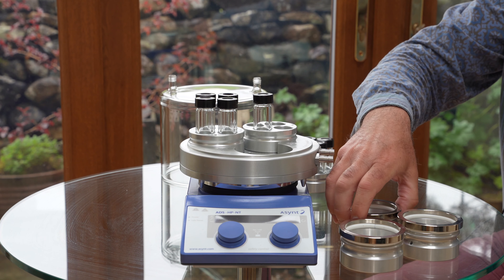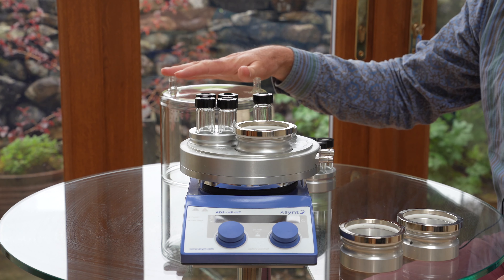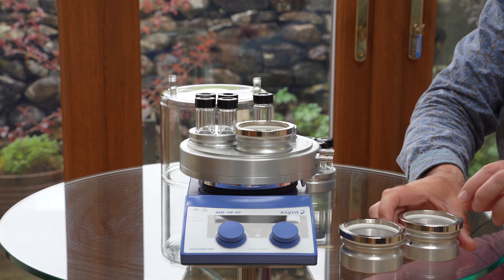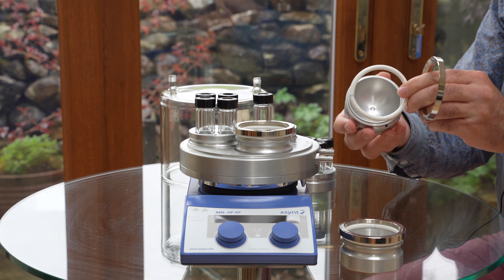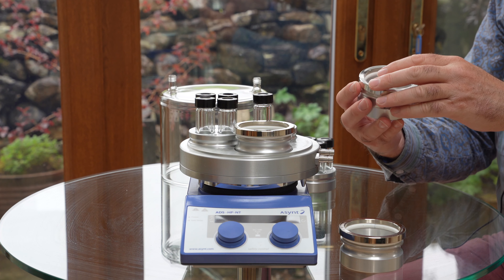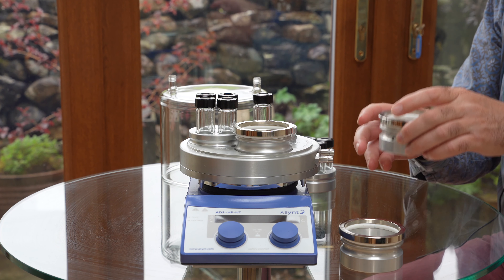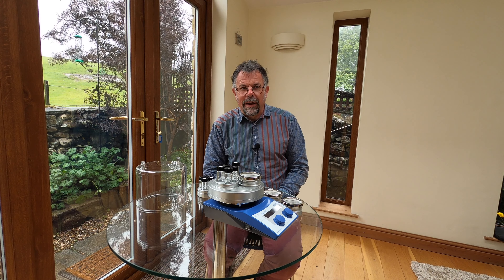If you want to work with round-bottom flasks, we have an option for that as well. The dome is not used then, but each of these inserts has an o-ring seal with a weight, and that stops any ice formation underneath the flask, removing any issues with the ice causing a fracture.